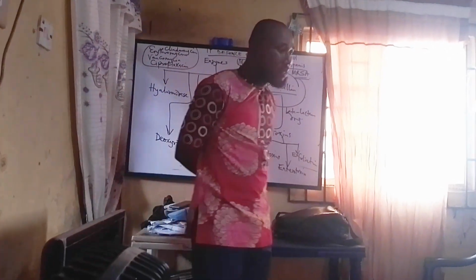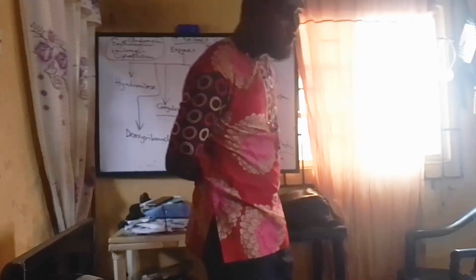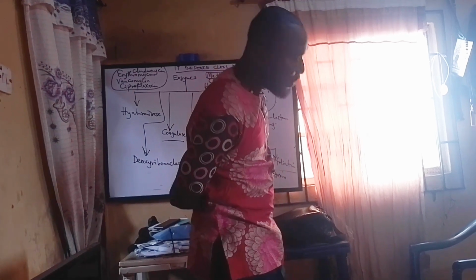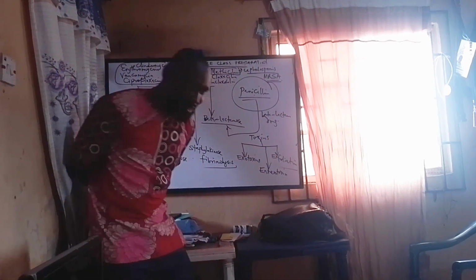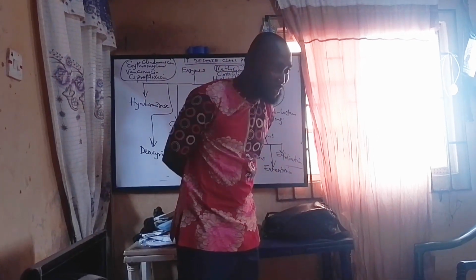And they'll ask you about the coagulase test because you must know each of them, what they use, the procedure. You must know them. That's the only way you can defend yourself. There are some tests that you must know the reagent they use. If you don't know it, problem. Like catalase, you use hydrogen peroxide. Because the work of catalase is to what? You can tell us the work of it.